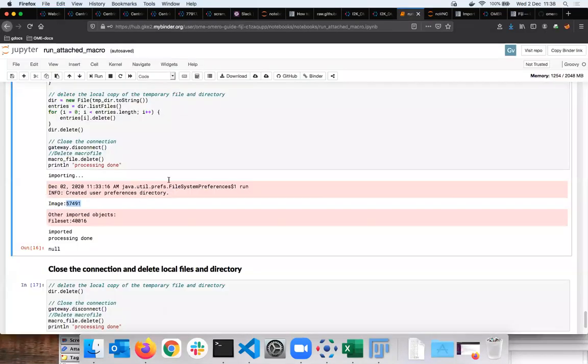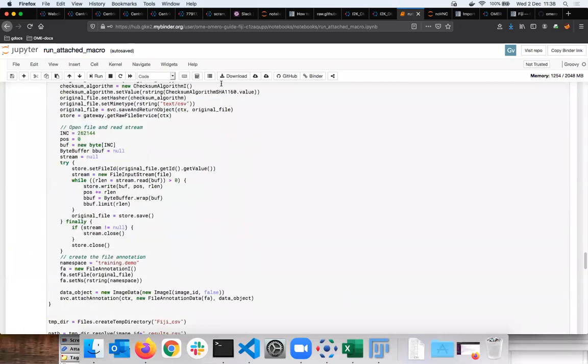Very good. If there are no questions, we could quickly try to show the CellProfiler, if there is interest in CellProfiler, or do something else according to your wishes. That would be just before the break, which is going to happen at 1:45. It's 1:45 very soon here in UK. Okay, so are there any questions on the Fiji workflow? And this is basically mainly representing the third-party tool analysis.